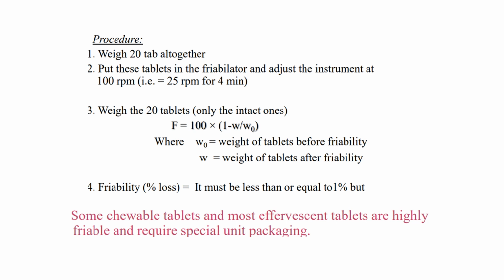And the chewable tablets and effervescent tablets are highly friable. Okay. So that's all about today's topic.